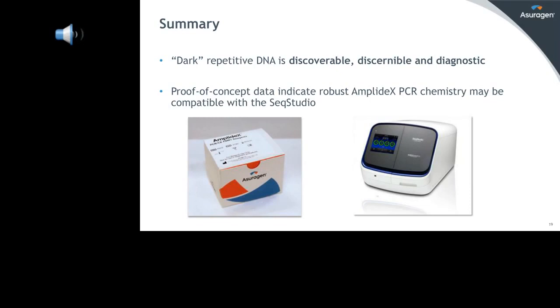Some of the ones that I showed data from today were run for about 55 minutes as a run time. Some of these were as short as 20 minutes. Voltage conditions, well, I gave you the example of how changing the run voltage can favor either sensitivity or resolution, and depending on what specifications were, we can turn that knob. So we actually evaluated a broad sweep of run voltages from 4 kV all the way up to 13 kV in one case. And then we played around a little bit with the injection voltage and time as well.